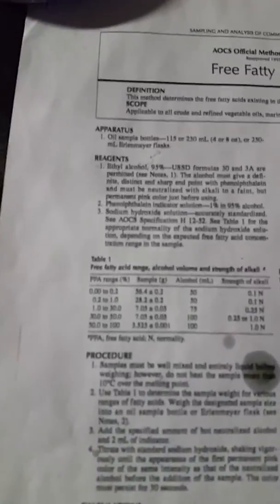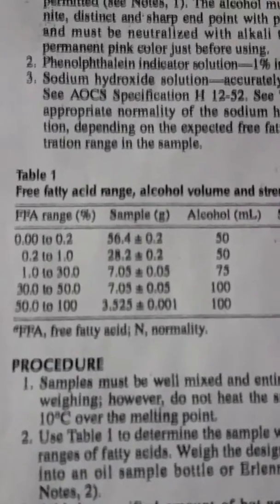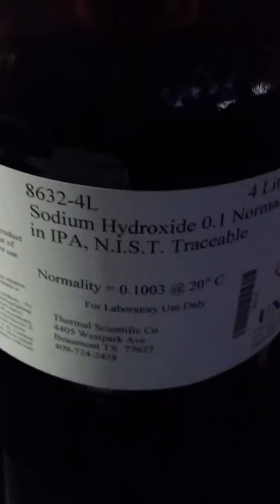This is the AOCS method for checking free fatty acids. Our grease typically runs an FFA range of 1 to 30, so we'll use about 7 grams of grease and 75 milliliters of alcohol. The alcohol we use is the phenolphthalein indicator — the phenol and alcohol together — and the only other ingredient we need is the sodium hydroxide.